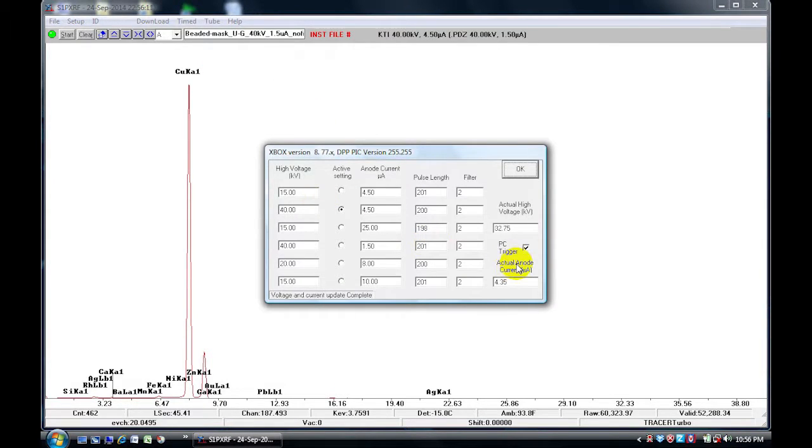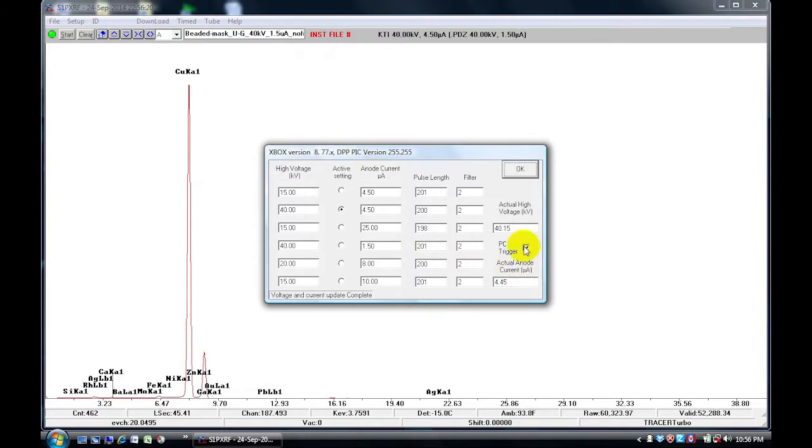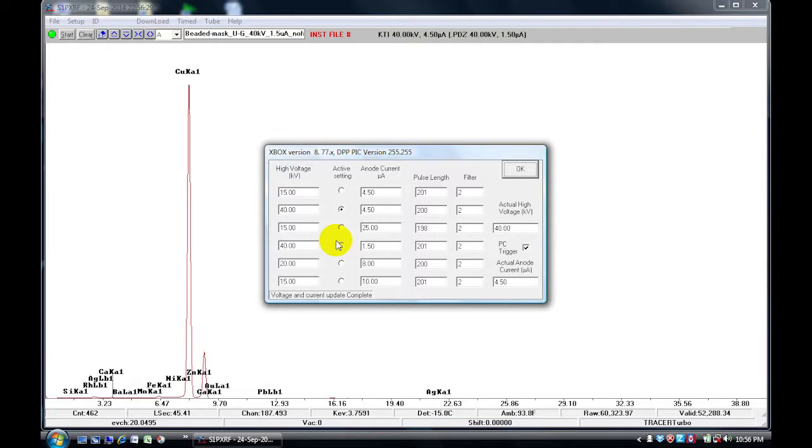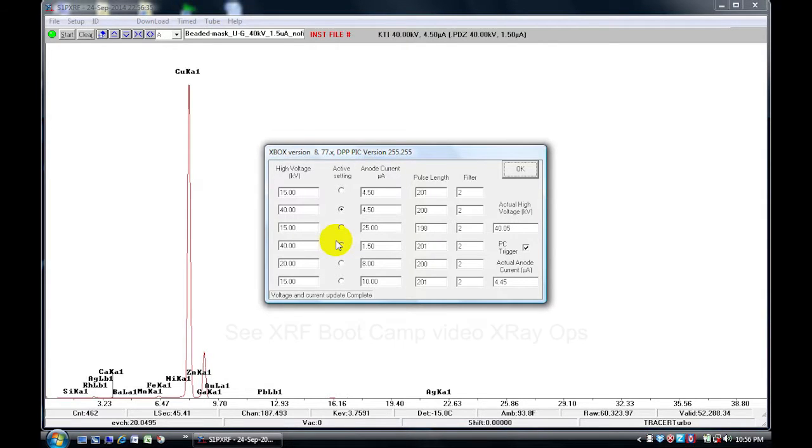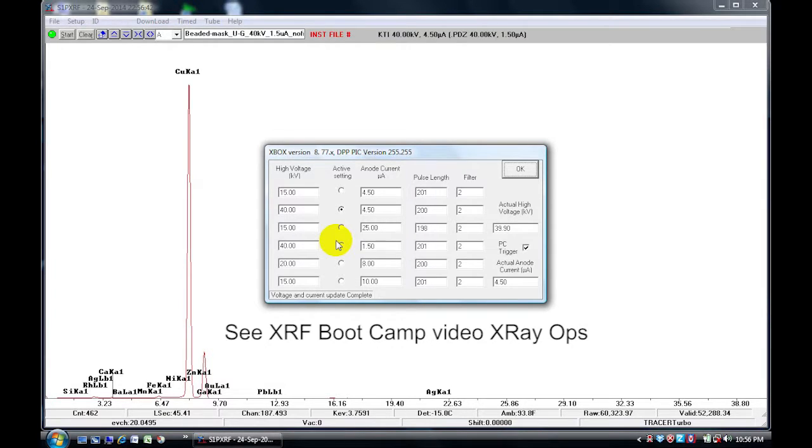The second location that the PC trigger can be activated or deactivated is also in this window, it's over here. This window also shows you the different voltage and current pairings that we've set up in the X-ray Ops, and this setup of the pairings is discussed in another session that's focused on X-ray Ops, so we will not discuss it here.